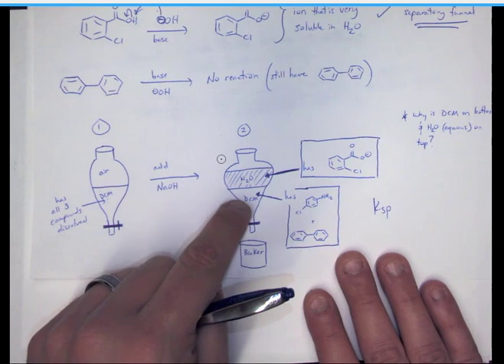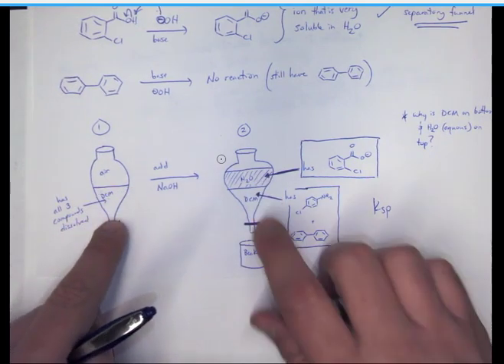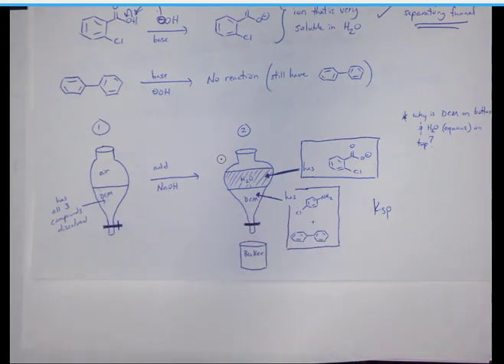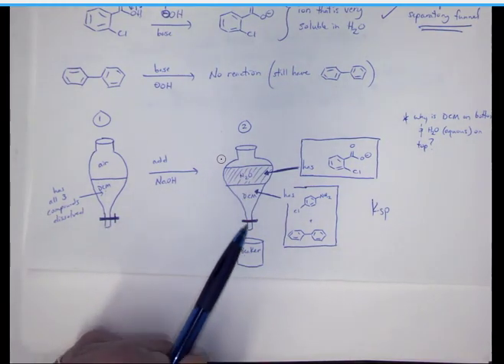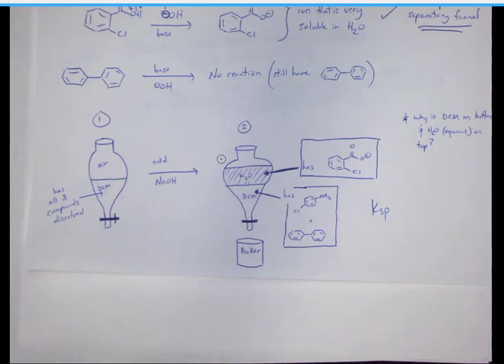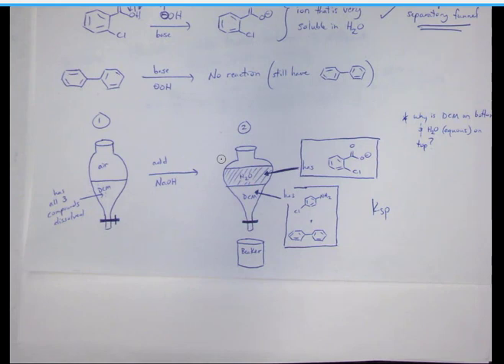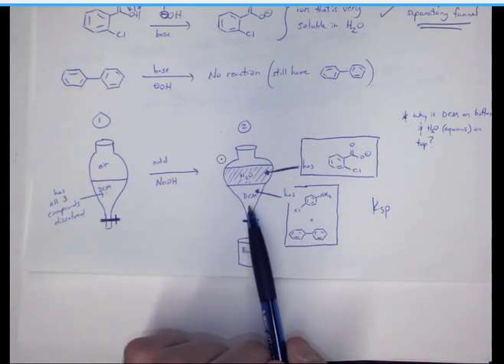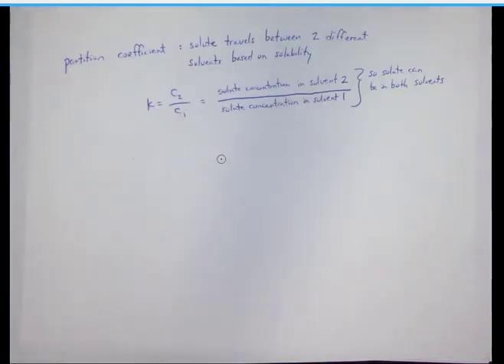Well, you want to separate these two, go back to where you now just have the DCM, and add another amount of sodium hydroxide, shake, shake, shake, get your two layers, and separate the two by letting them flow through the end here. You'll have your organic and your aqueous, and then do it a third time. So the more you do it, the more of this deprotonated acid you're going to pull out of the DCM, based off of partitioning.